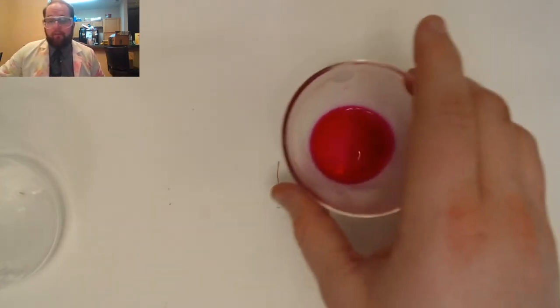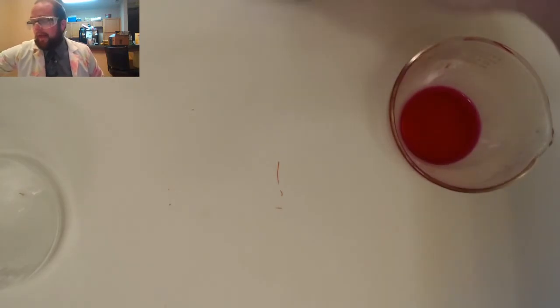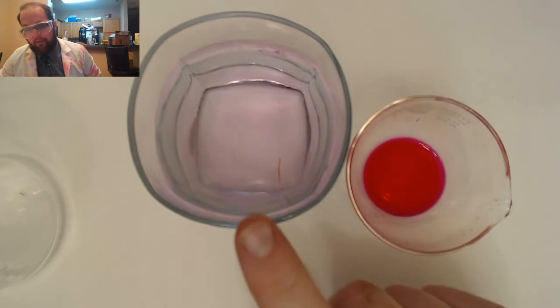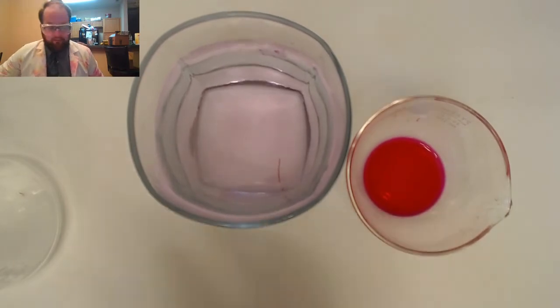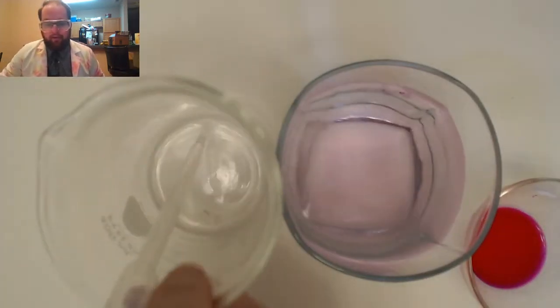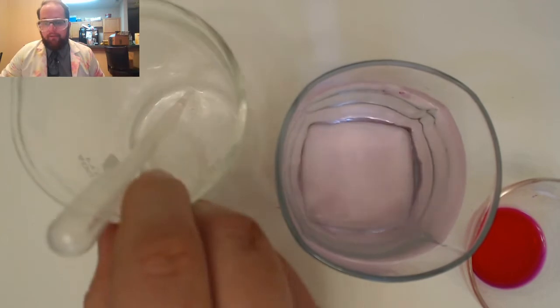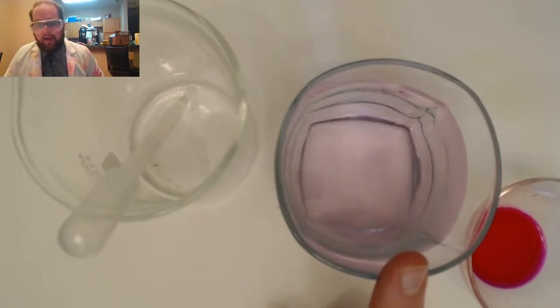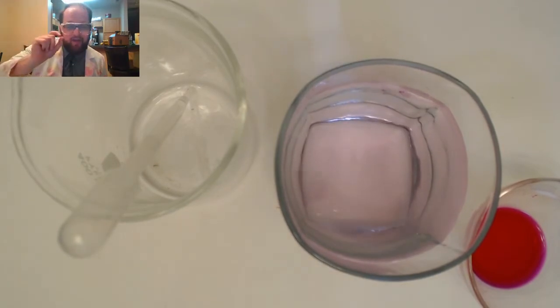Ideally, what I'm looking for here is something a little bit more like this. A very, very, very pale pink. It might be even a little bit tricky to see. Let me put the clear liquid in next to it again. Hey, look at that super pale pink. You can see the clear liquid on the left and the pale pink on the right. This means that all of our acid has been canceled, but just barely. There's a teeny little bit of extra base.